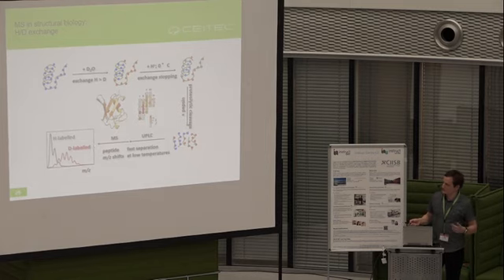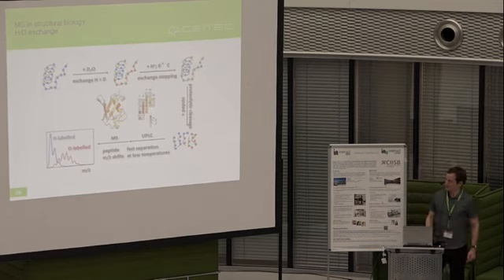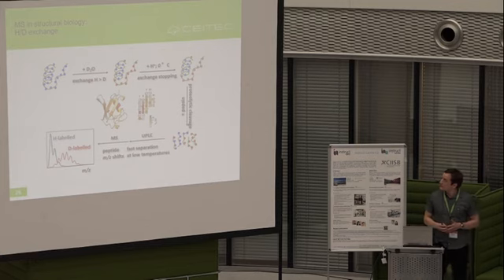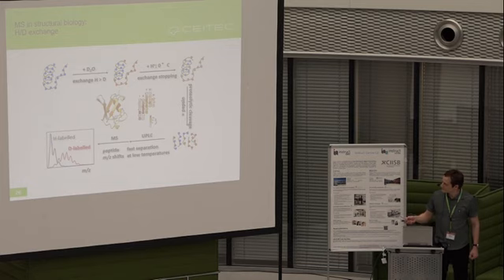Unfortunately, data treatment is quite complicated because their signals overlap, and also the chromatographic behavior of light and heavy forms of the peptides is different, so the forms do not comigrate perfectly. Usually, this experiment is carried out in differential form, so you have some protein with or without the presence of a ligand, and you see how the conformation of the protein changed, and then you see the difference also on the level of mass spectra of the light and heavy forms.